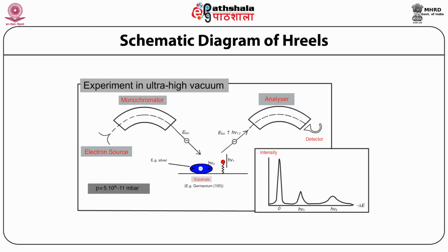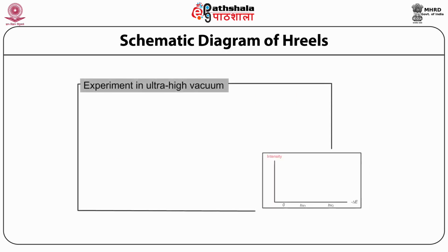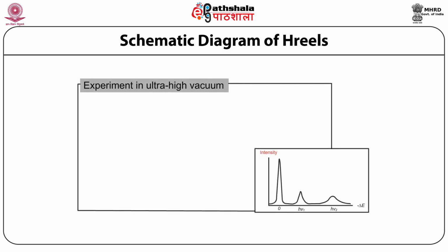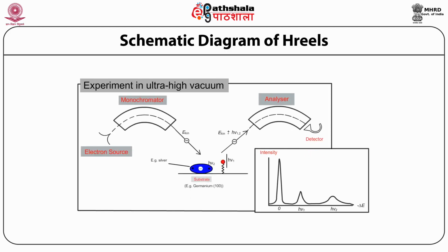With the tilting analyzer, it is possible to scan the energy of the reflected electrons, angle resolved. Excitation with momentum parallel to the surface will lead to a change of the angle of the reflected electrons with respect to the elastically scattered electrons.